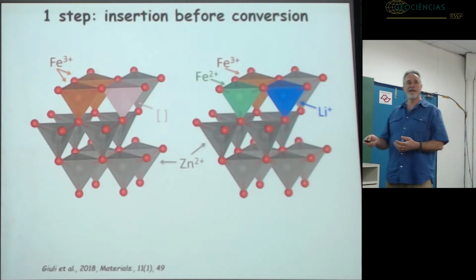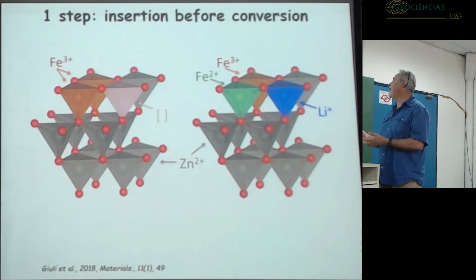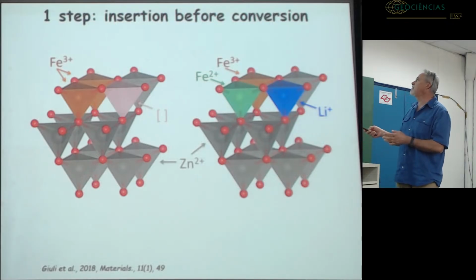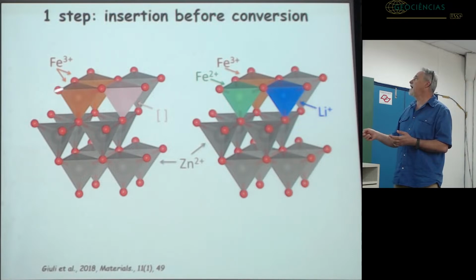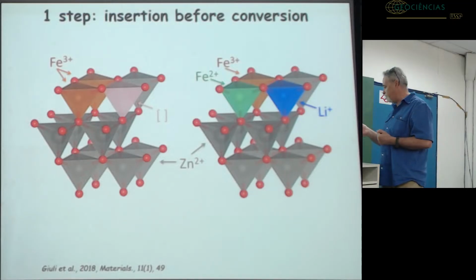So in this case, a local probe can allow us not only to get crude numbers like the iron redox ratio, but also to get some hint on how iron is distributed in the structure and some suggestion about the clustering of both iron tetrahedra and vacancies, and the possible use of those vacancies for an intercalation before amorphization.